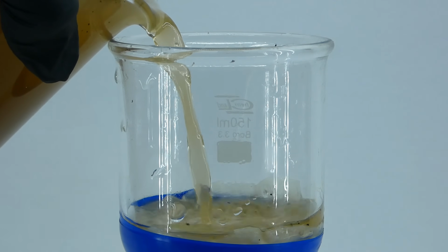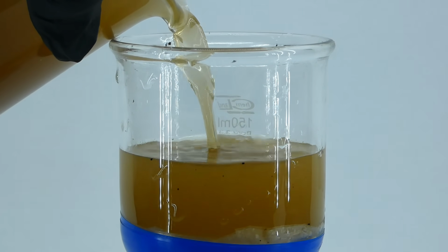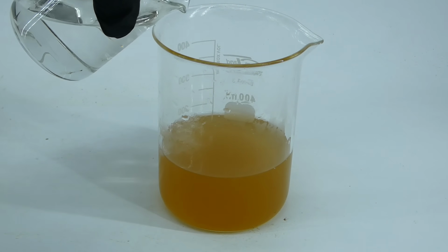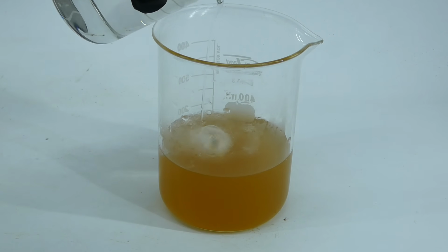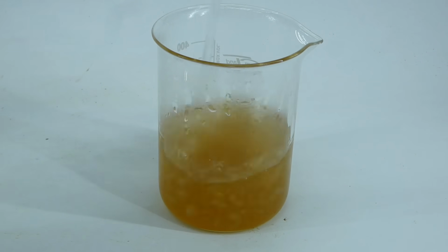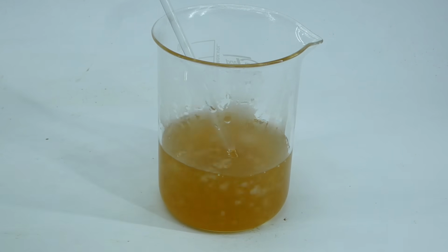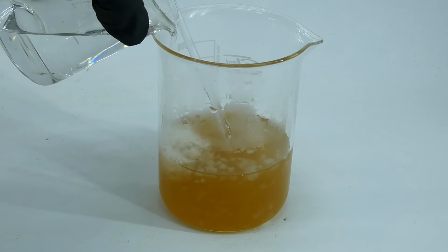Anyway, I filtered the solution, and now for the final test that will tell me that the reaction had worked, I poured in a few milliliters of 50% sulfuric acid. Almost instantly, a goopy crust started to form, and it was the silicon dioxide. This told me that the reaction worked only partially, and in the future I should probably add more sodium hydroxide.